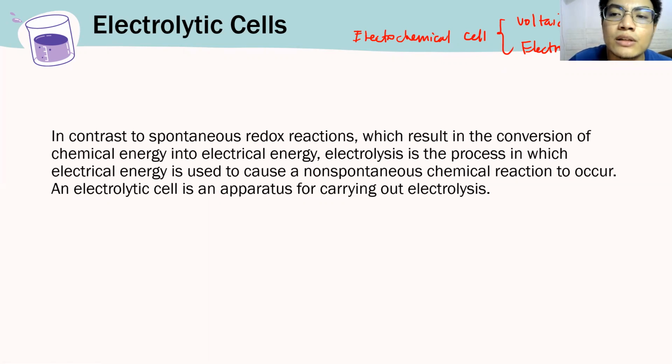While for electrolytic cell, their potential is negative, meaning that the reaction is not spontaneous. That means you have to add electricity for a non-spontaneous reaction to happen. Okay. So there are many applications of electrolytic cell.